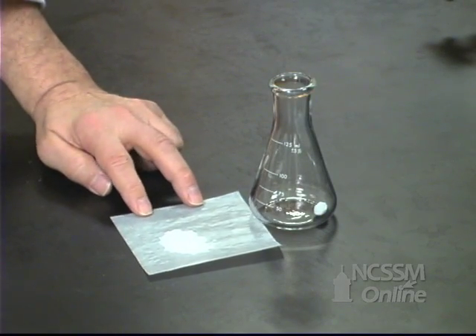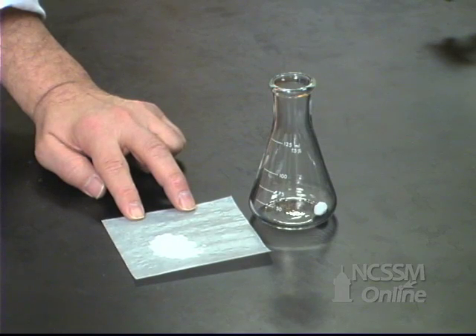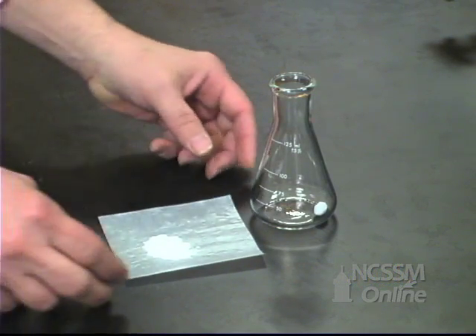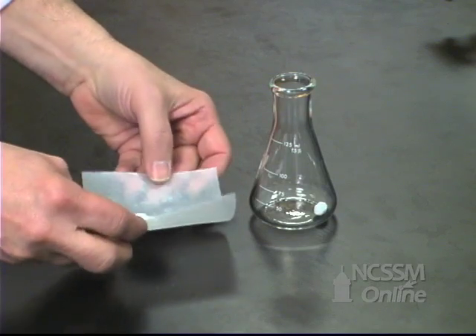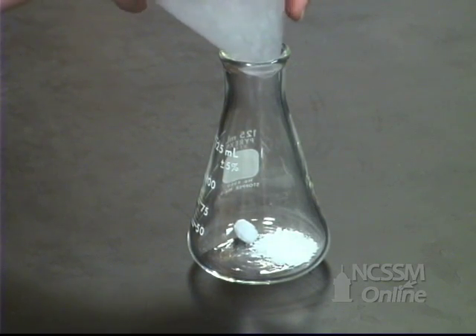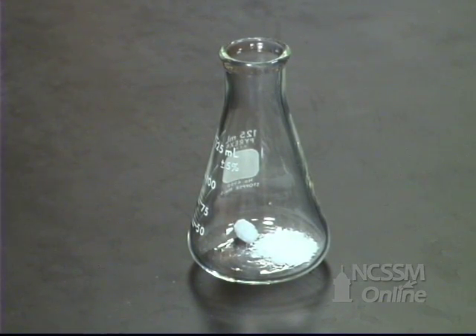We're going to analyze the same two-component system of sodium hydrogen carbonate and sodium carbonate by volumetric analysis. We've massed out about one gram of the mixture and we're going to add that to a 125 milliliter Erlenmeyer flask. We're now going to pipette 25 milliliters of a standardized solution of one molar hydrochloric acid to the mixture.